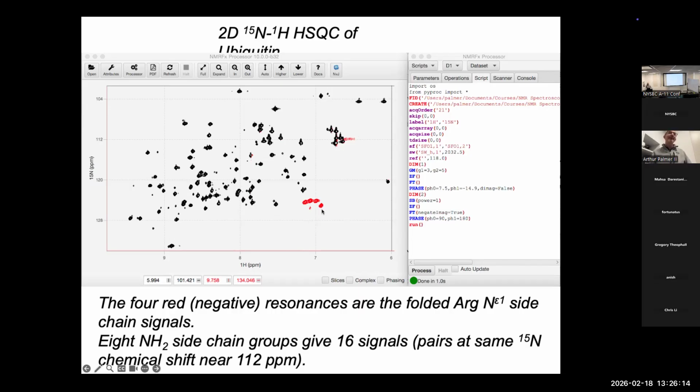So if you sample with half a dwell, half of delta T1 in the first point, peaks that are folded are upside down. If they fold twice, they'll be back right side up again if they go around twice. So sometimes this is useful for finding peaks that are folded. On the other hand, it can be not useful if these peaks are near regular peaks, because then the negative lobes start to interfere with the positive lobes of your real peak.